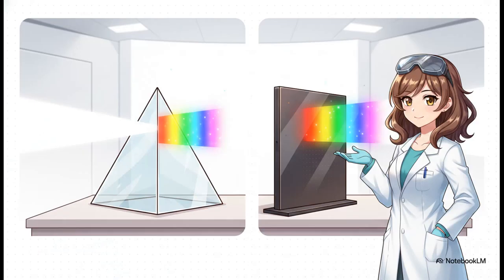But how does it actually separate the light? Well, historically, older instruments used prisms, but as our notes from Dr. Kem point out, prisms have a non-linear dispersion. That essentially means they spread UV light out way more than visible light, and they also suffer from lower efficiency because of reflection losses. Modern instruments instead use what are called diffraction gratings. Gratings are amazing because they provide a linear, totally uniform dispersion across the entire range, and they are highly efficient. They're absolutely the gold standard for getting our single photon perfectly isolated.